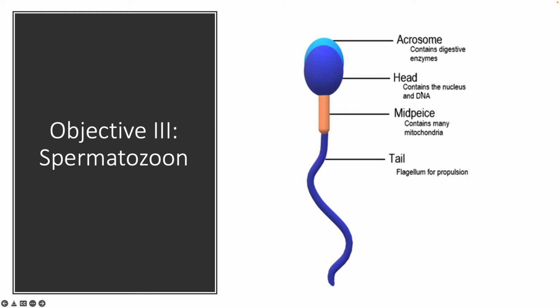So these four different regions you should be able to identify, as well as if I ask what would be contained in the head, you would tell me a nucleus.